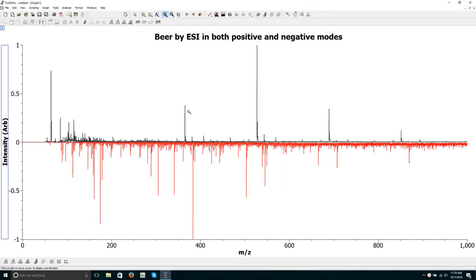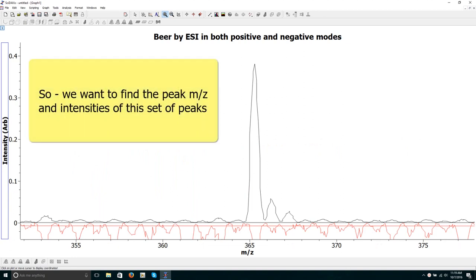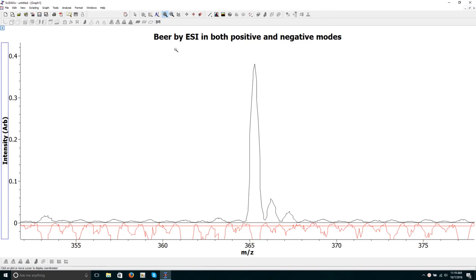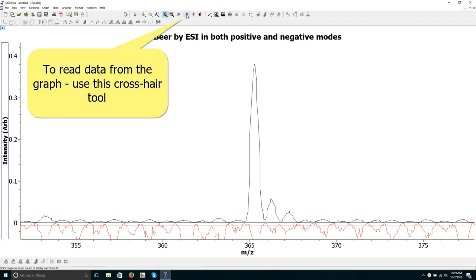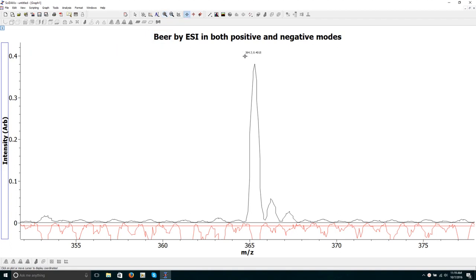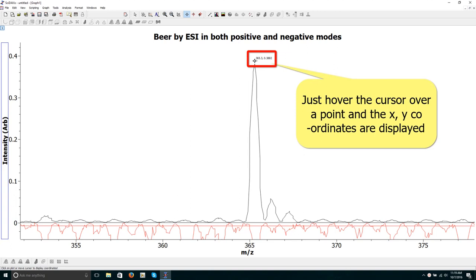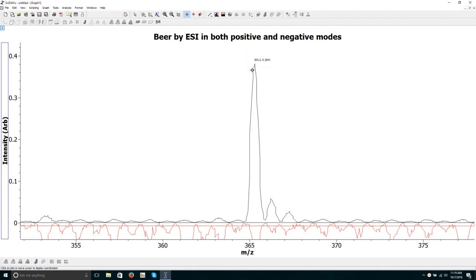Finding peak masses and intensities: we want to find the peak masses and intensities of this set of peaks. To read data from the graph, use this crosshair tool. Just hover the cursor over a point and the x and y coordinates are displayed. You can then note these values in Excel so you can use them for peak assignment purposes.